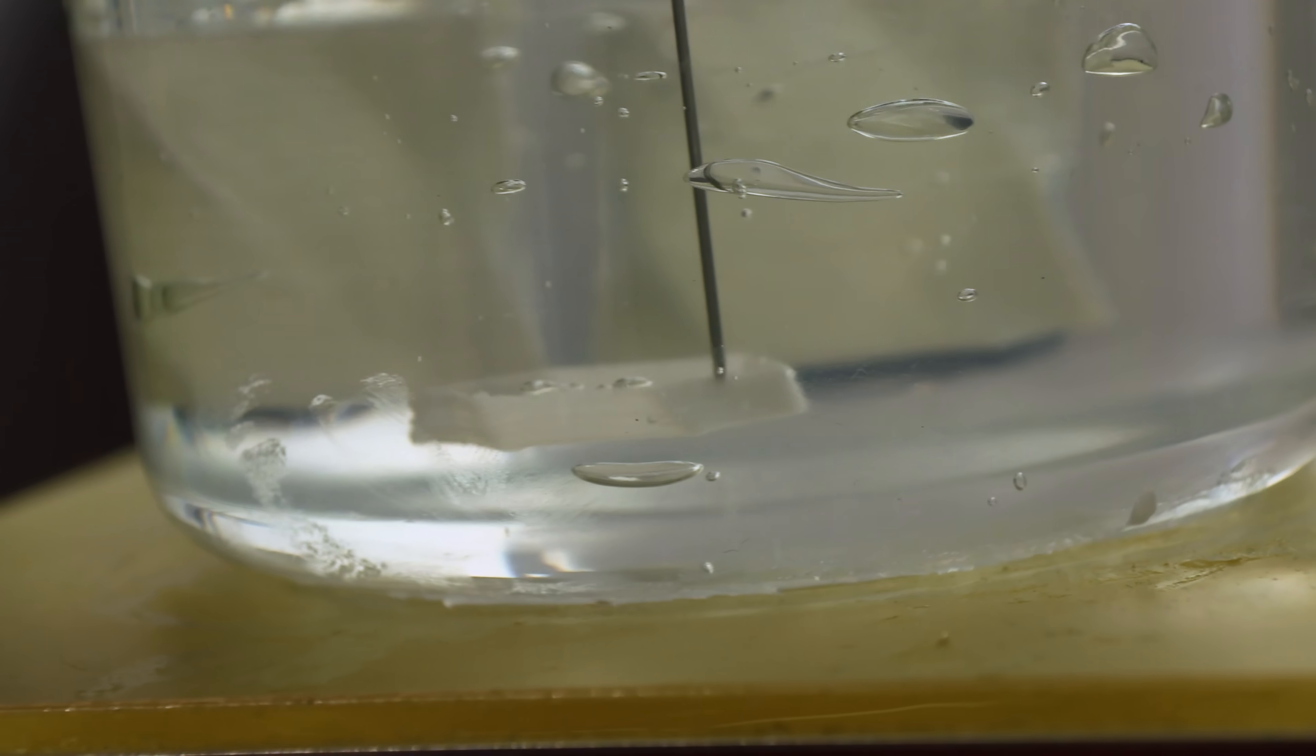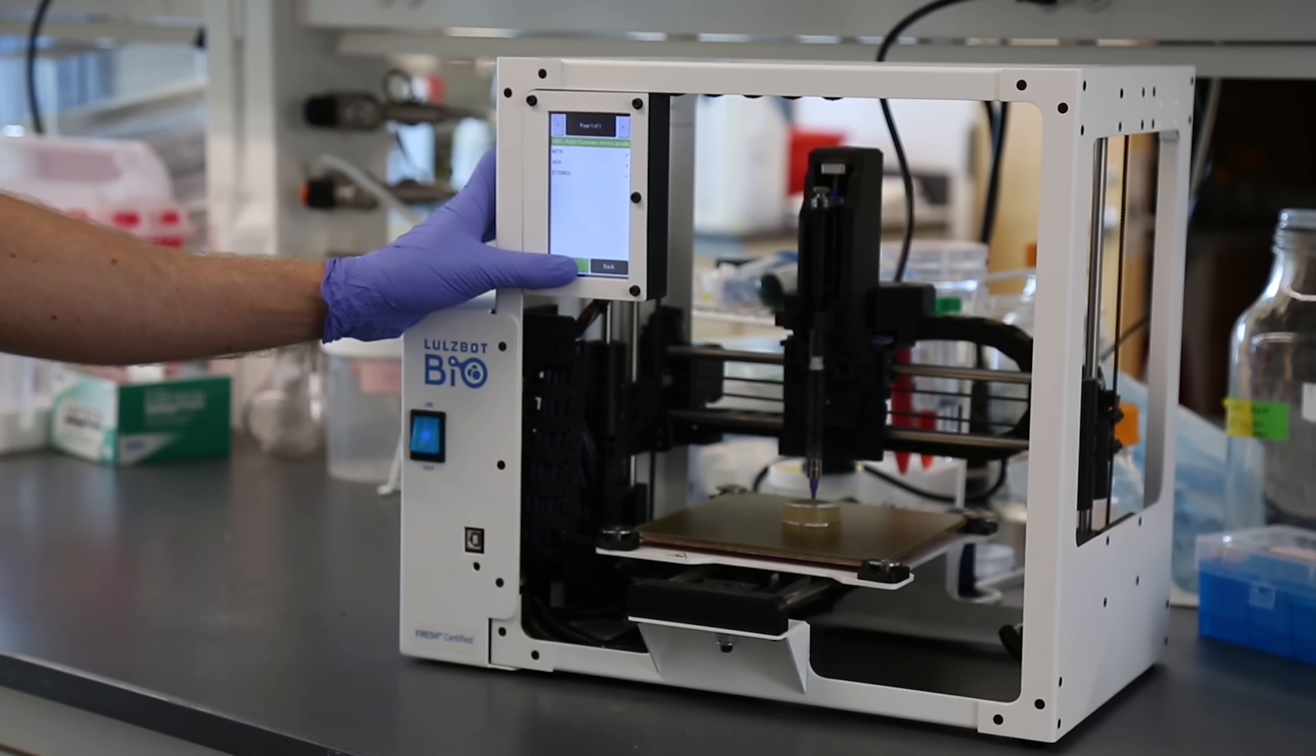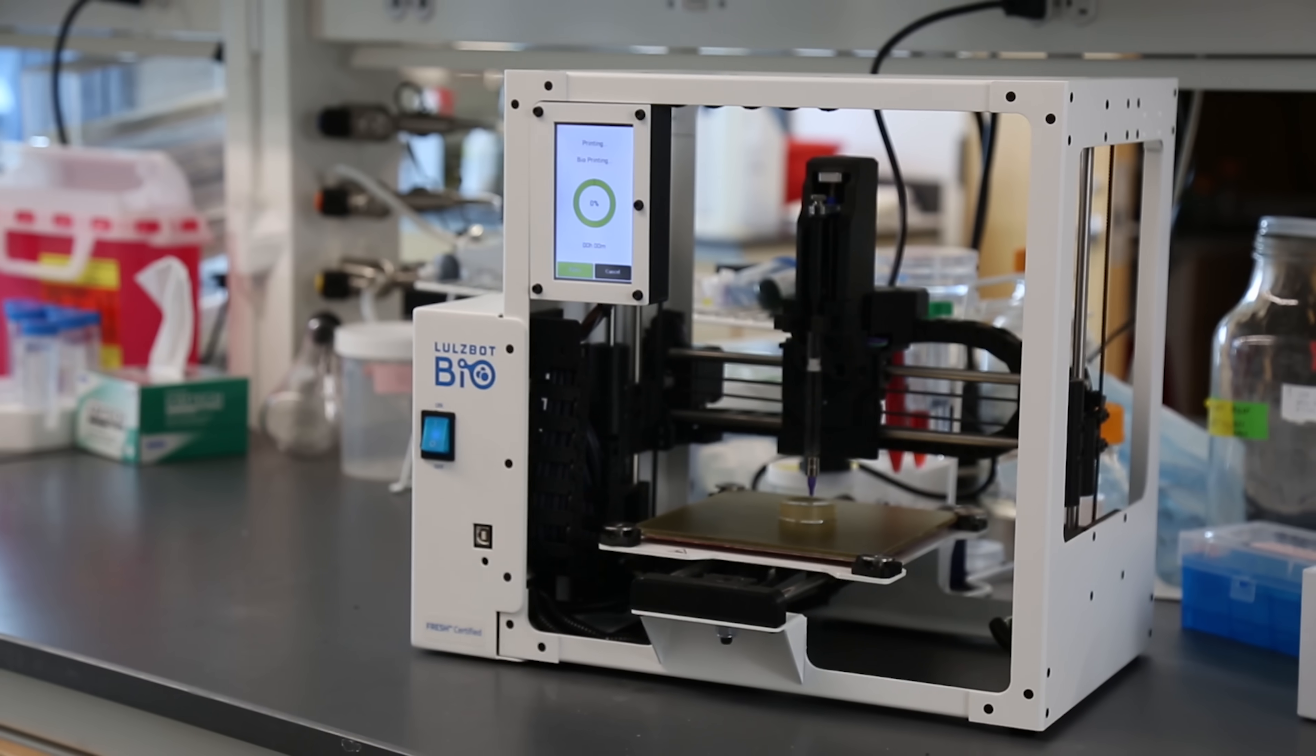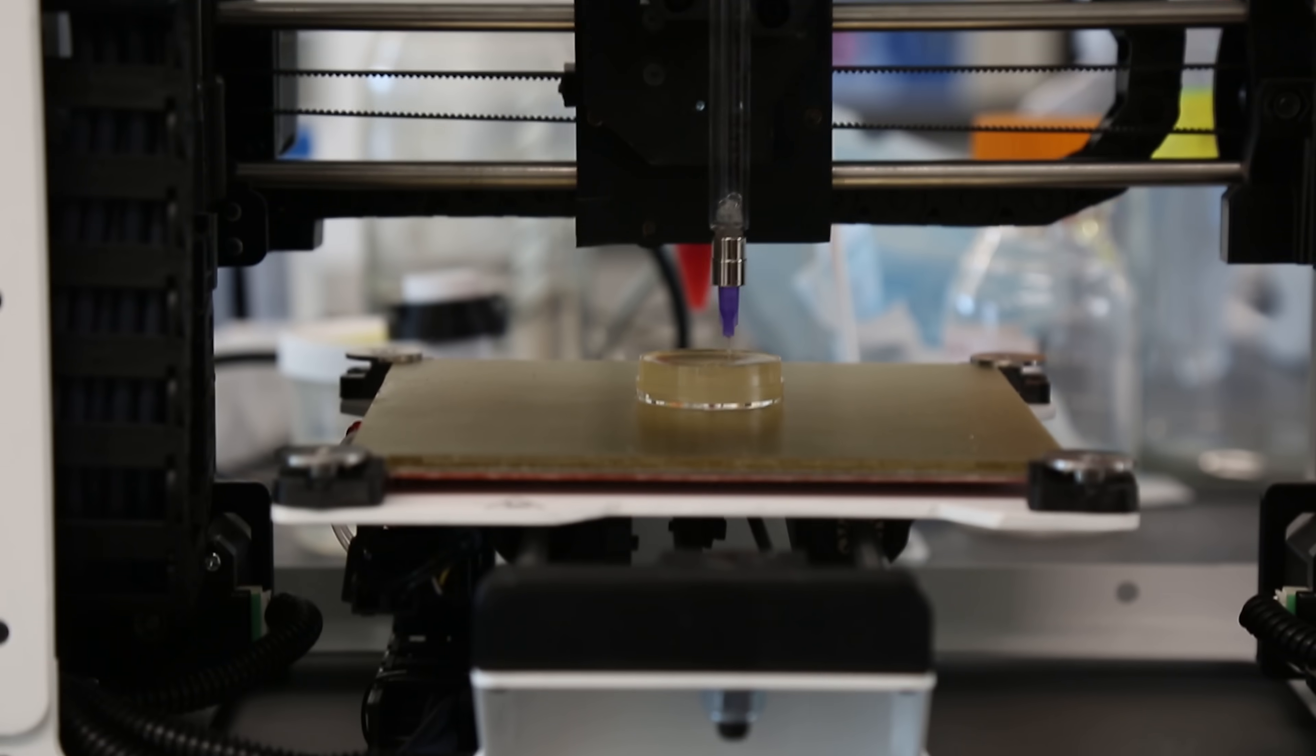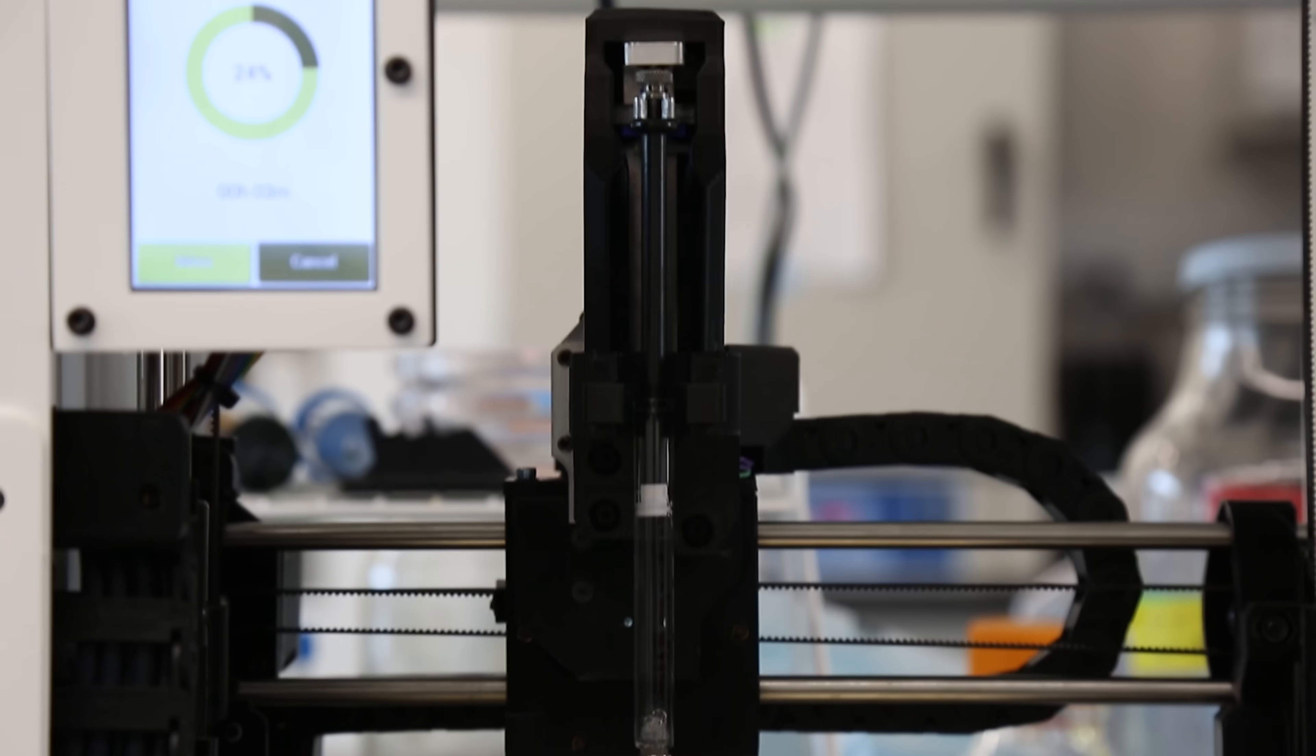So when you do traditional 3D printing, there's something called inner layer adhesion. You're probably familiar with that. Plastic melting on top of other plastic. It holds together pretty well. So basically in bioprinting, that is the same thing. Some materials are not native in terms of cross-linking, so you have to do photocross-linking. You can do heat changes, pH changes. You can alginate. You add calcium to it, and it allows it to cross-link. So the material that comes out of here is supported within that life support gel, and it may need to be cross-linked, meaning that it needs the layers to adhere to each other. Yes. And you can do that post-printing. Yes.